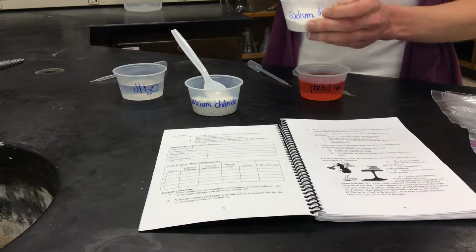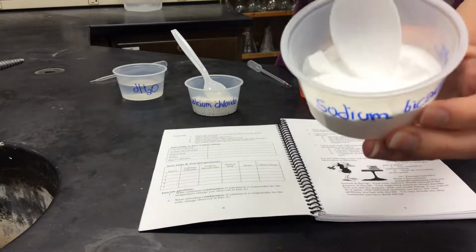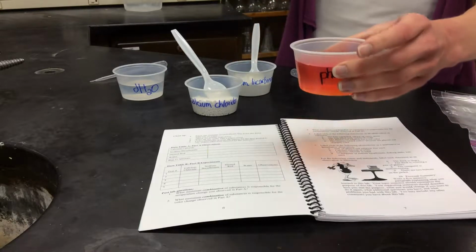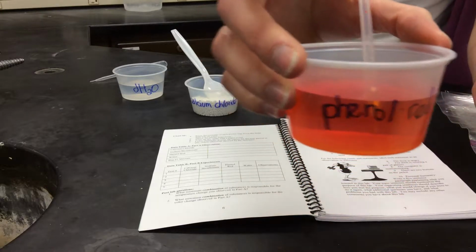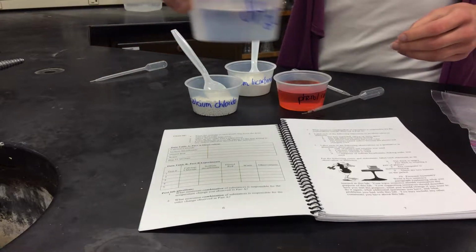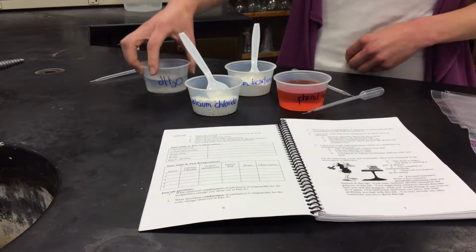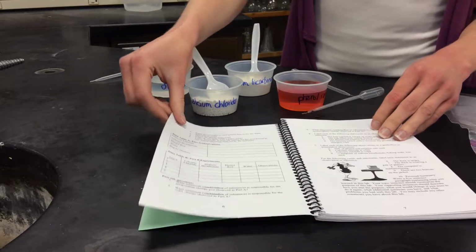Now you need to write down some observations about sodium bicarbonate. You can see what that looks like. And then lastly, you need to write down some observations of phenol red. So this is phenol red. And then write down some observations about water. Okay, it has a D in front of it because it is distilled water. Alright, so hopefully you've written down some observations just about the physical appearance of those things.